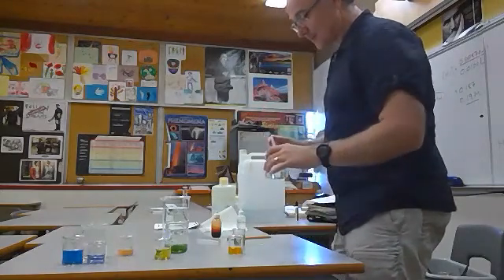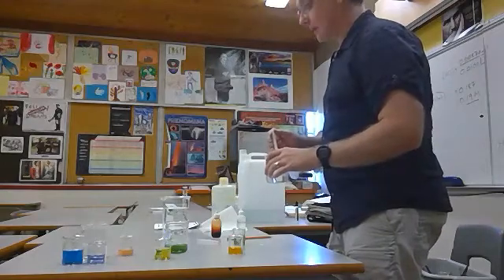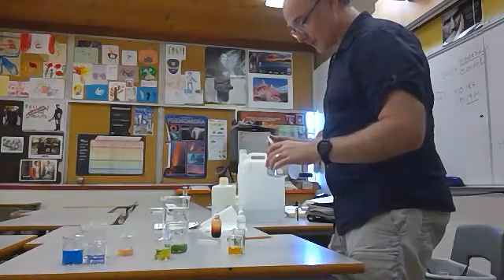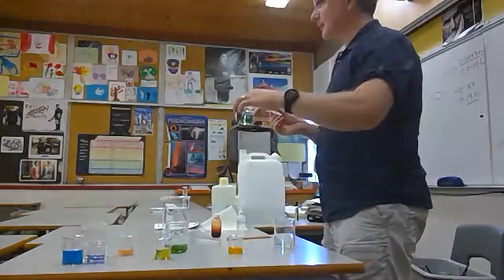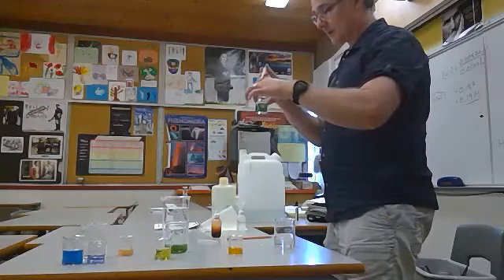Okay, so there we go. So that's one drop in that. Now if I take it to my buffer solution, so this is pH 7 roughly, same as the water, right? And I add a single drop.